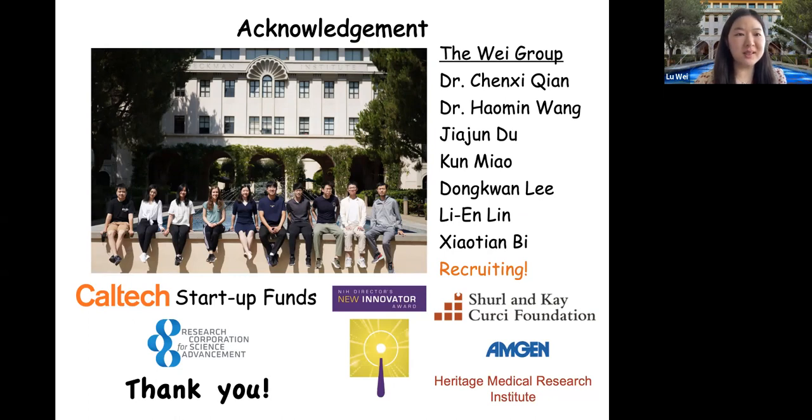So the longest we have been doing is, I think, probably a few days, but then you have to image every couple of hours. I think for that, it has been fine. But longer than that, I have never tried. So sorry, I don't have a good answer for that.